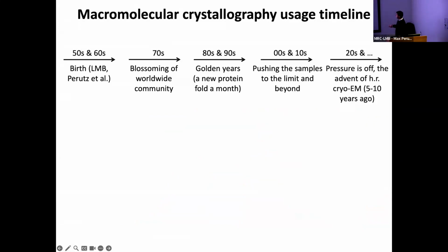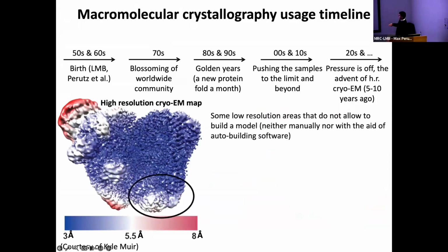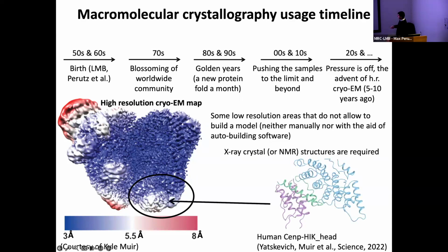with these large complexes. However, sometimes you can get regions in the EM where the resolution is not very good. So with this, we can just crystallize a small domain, do the crystallography and get very high resolution. At least this is what was done before AlphaFold.